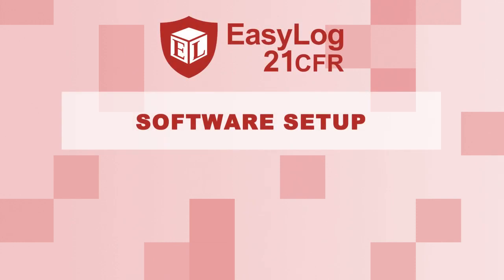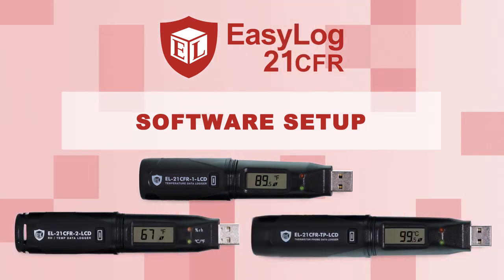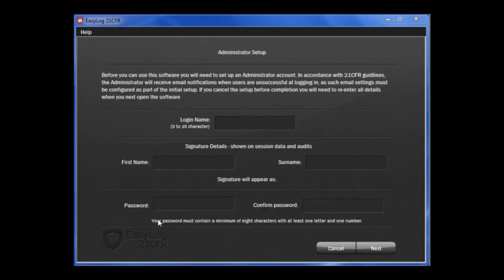In this video, I'm going to be showing you how to set up the 21 CFR EasyLog USB data logger. Our 21 CFR software is an administrator-based system, so before you can use the data loggers, you are required to set up an administrator. Where it says login name, create a username between 3 to 15 characters.